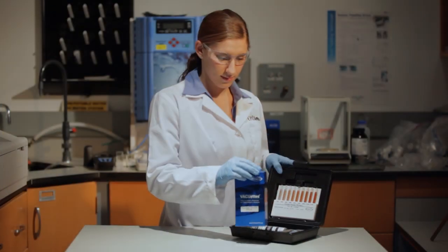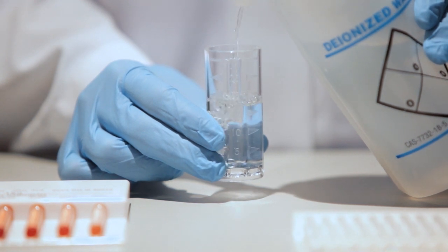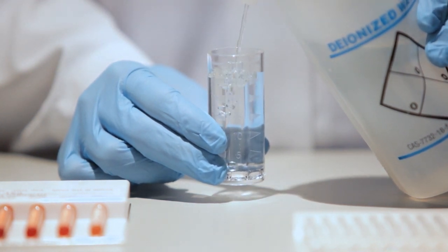To perform a test using VACUettes, fill the diluter snapper cup to the milliliter mark with purified water such as distilled or deionized water.